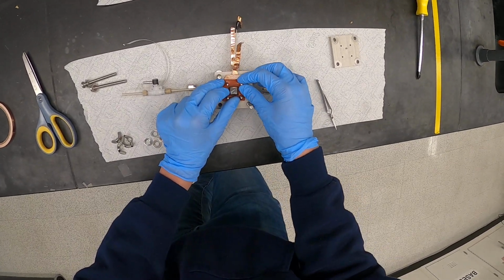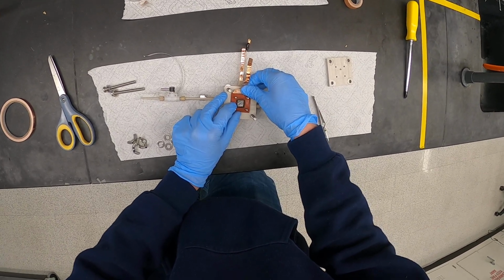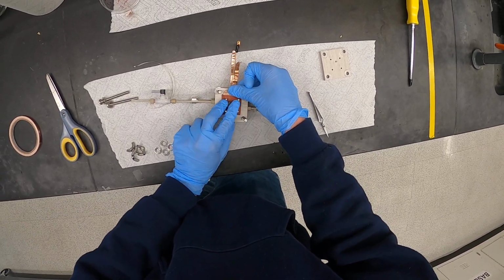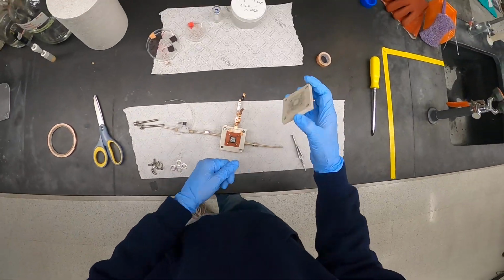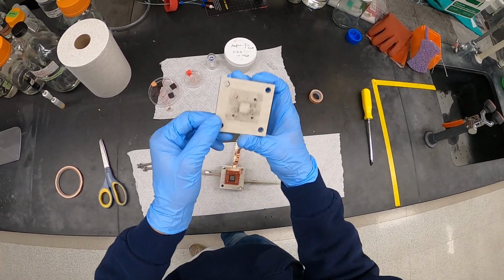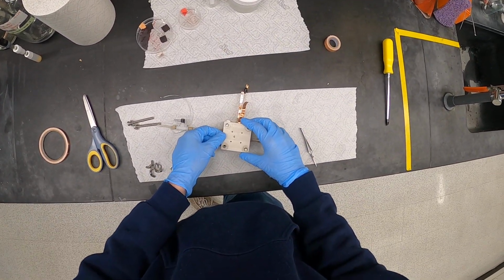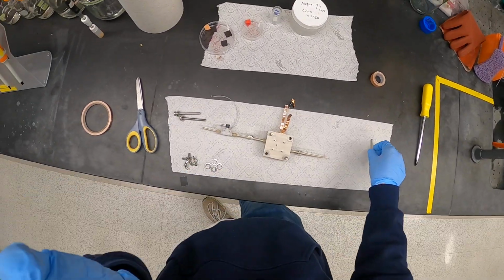And now if you can see, there's a little bit of that copper tape showing. That's something you want to avoid. So I'm going to go ahead and pull that electrode up so that copper tape is not in the working area. Great. Cool. Now there's no copper showing. And the last plate, doesn't really matter which way you put it on, but usually use this way. That has the sort of black staining on it facing down. Rotate those screws, and great, all the plates are on.